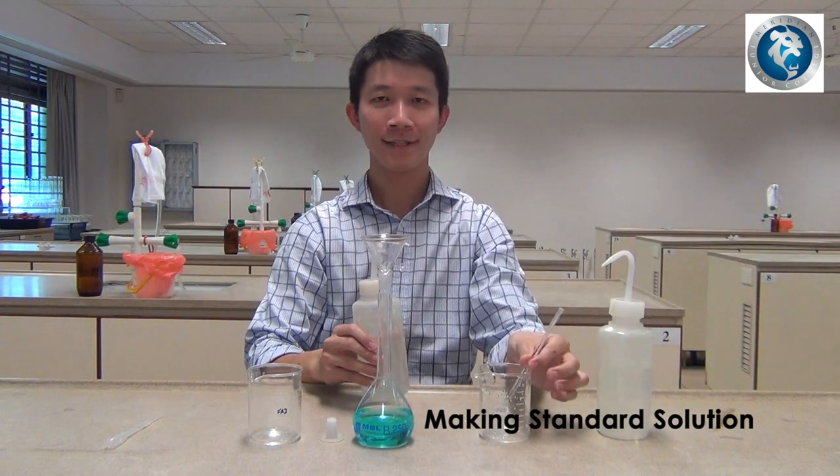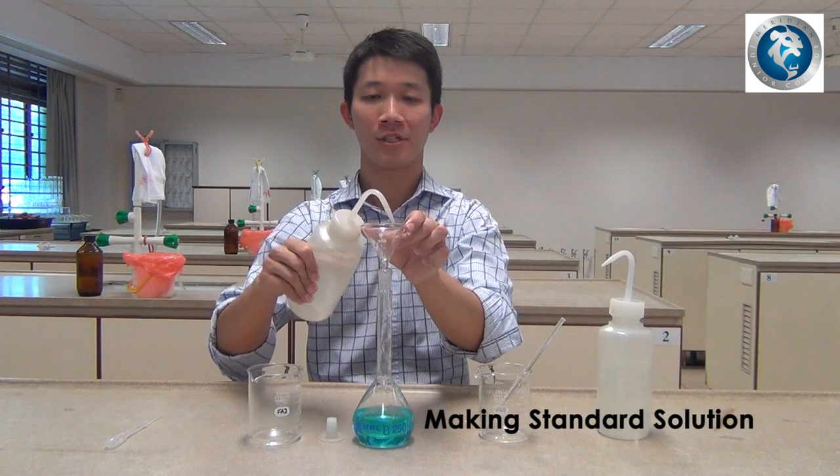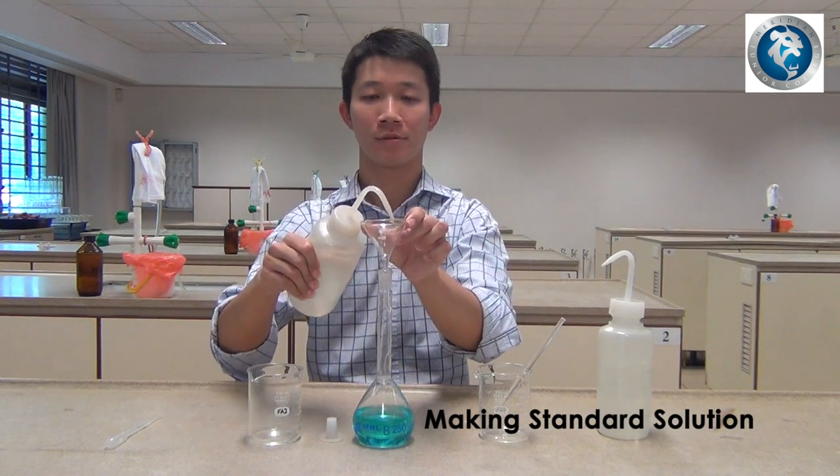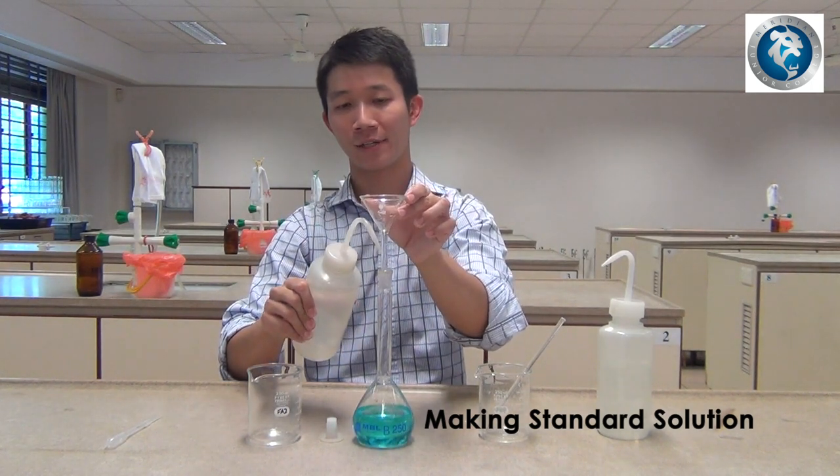Once that is done, rinse the glass funnel using de-ionized water. Also rinse the tip of the glass funnel.